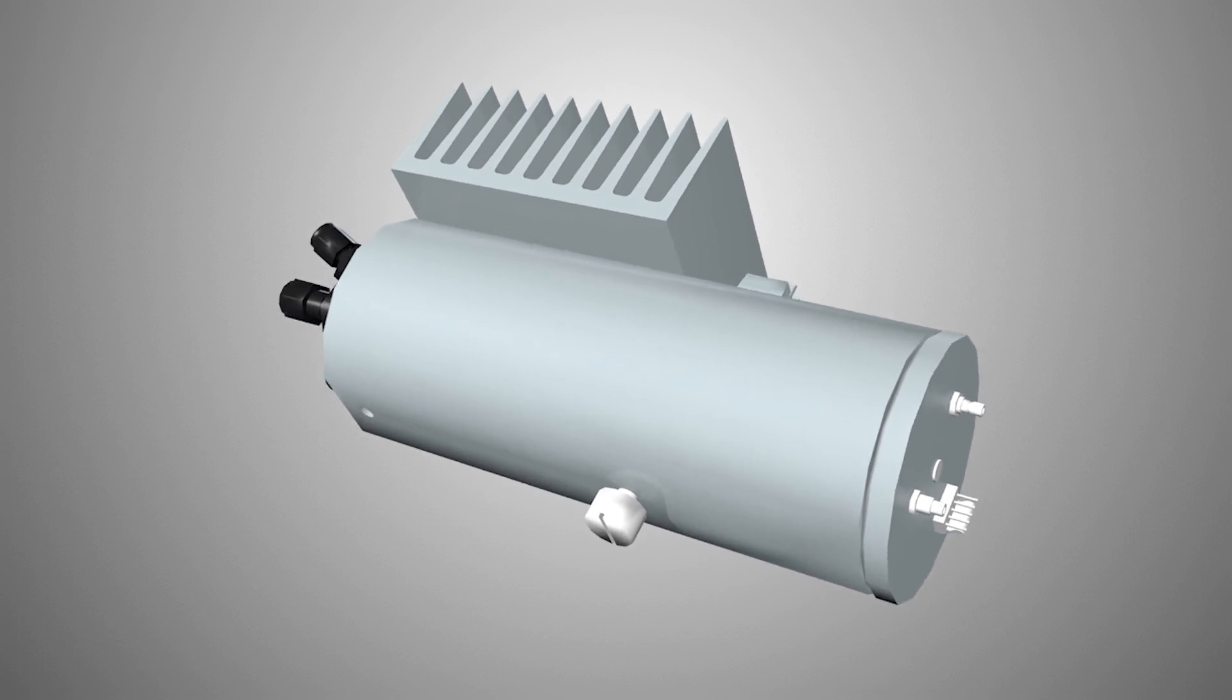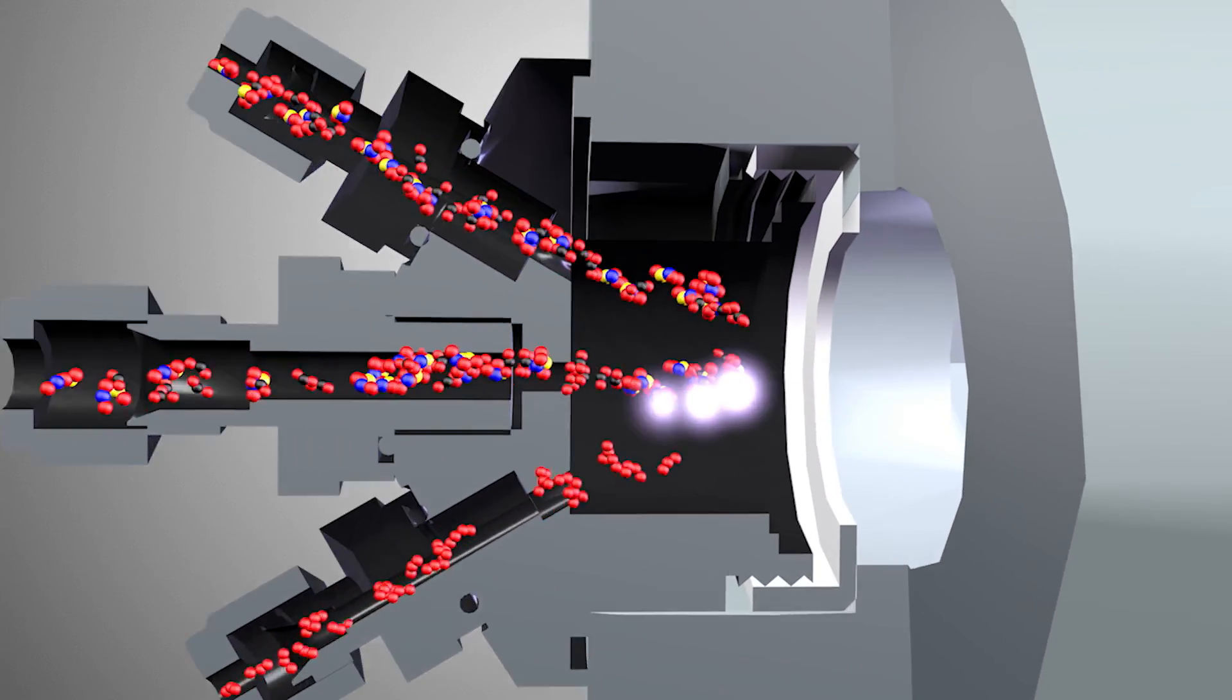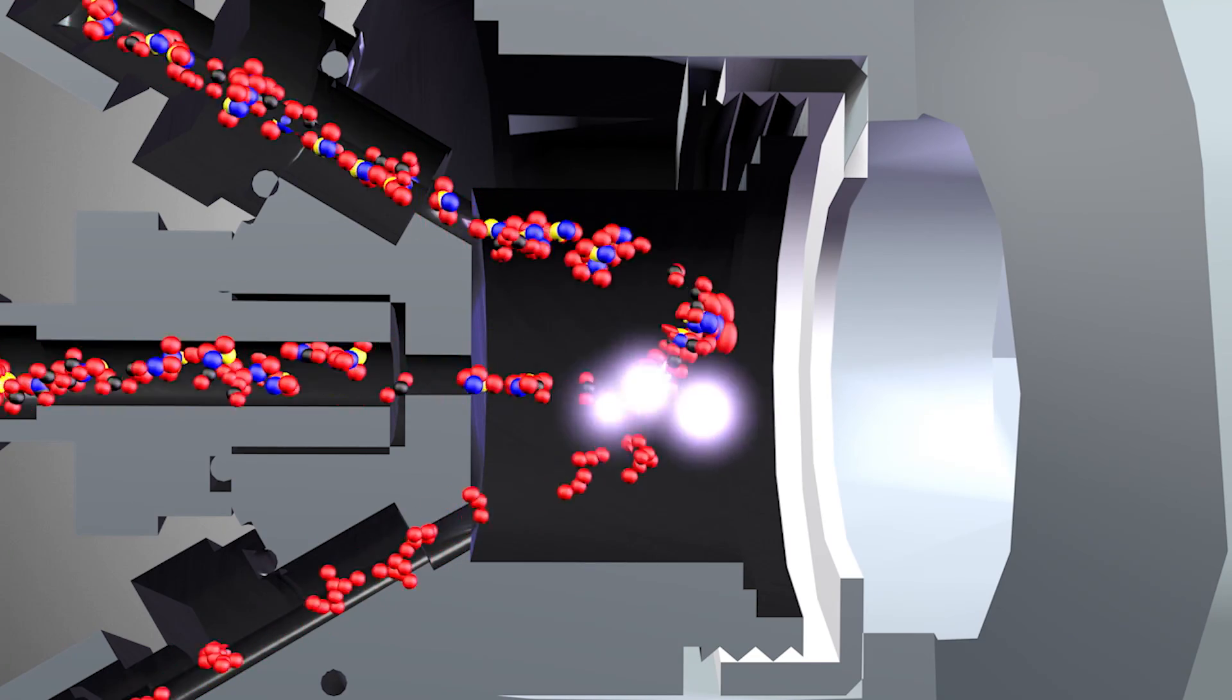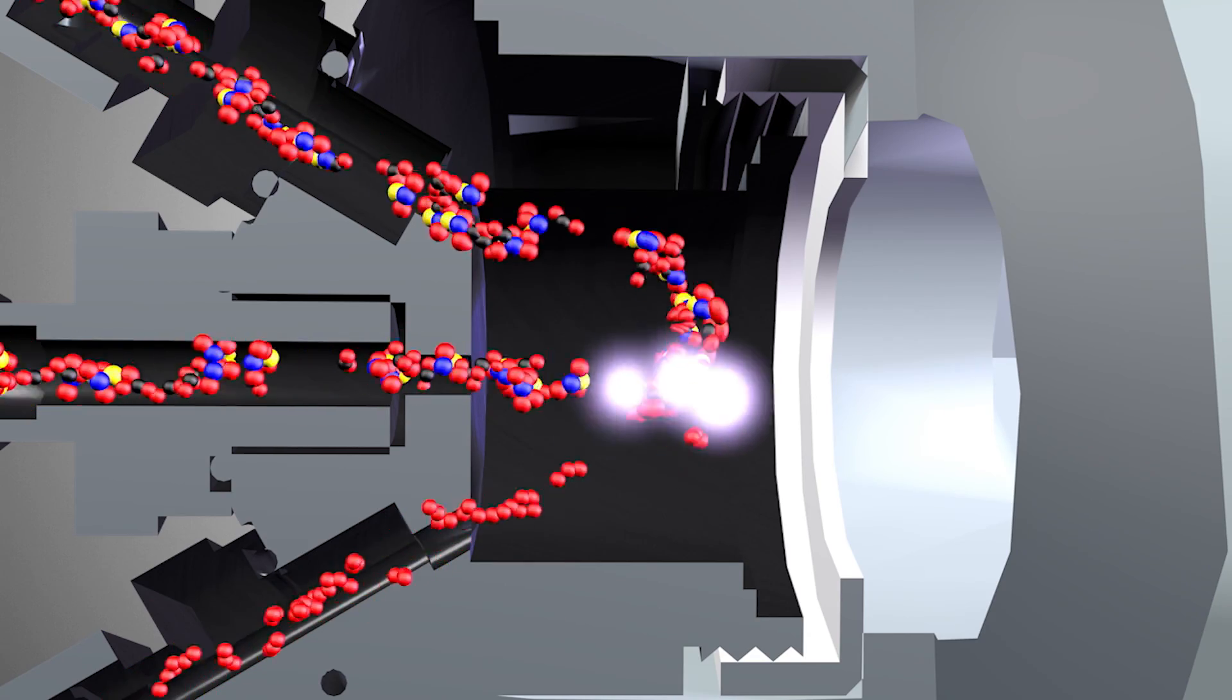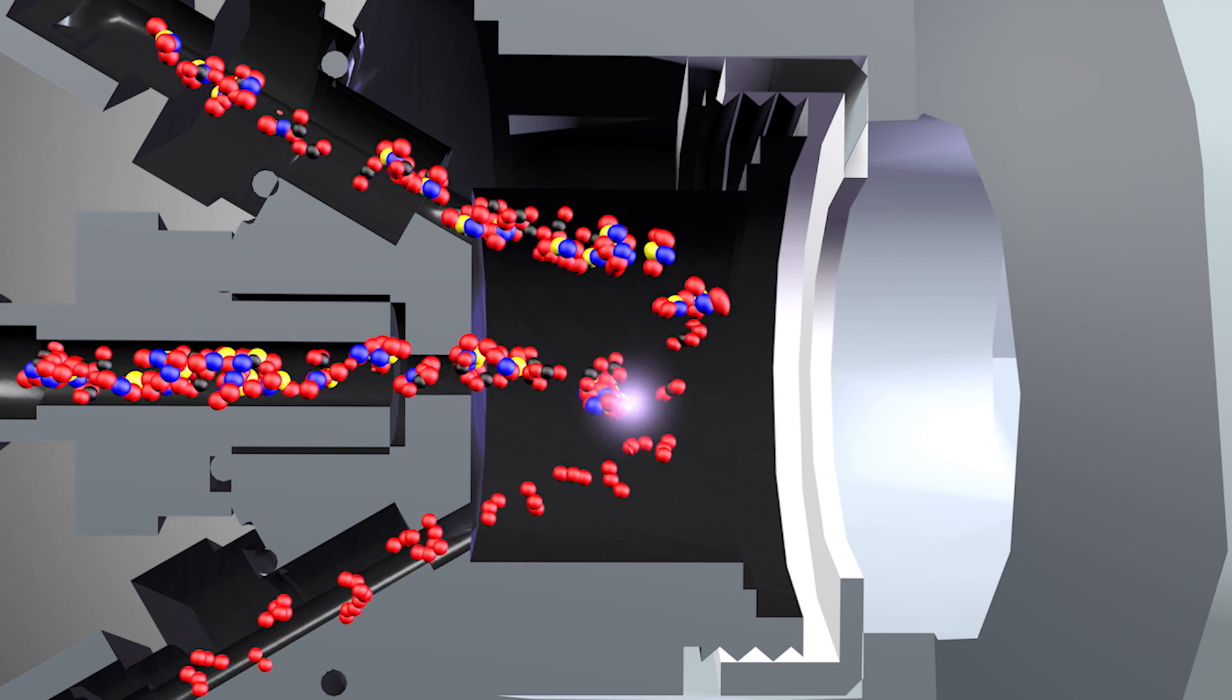If equipped with a nitrogen detection system, the sample passes into the nitrogen detection cell. The sample is mixed with ozone, converting nitric oxide to nitrogen dioxide in an excited state. Upon returning to a stable state, energy is emitted as a flash of light, which is measured by a photomultiplier tube. The amount of light emitted is proportional to the amount of nitrogen in the sample.